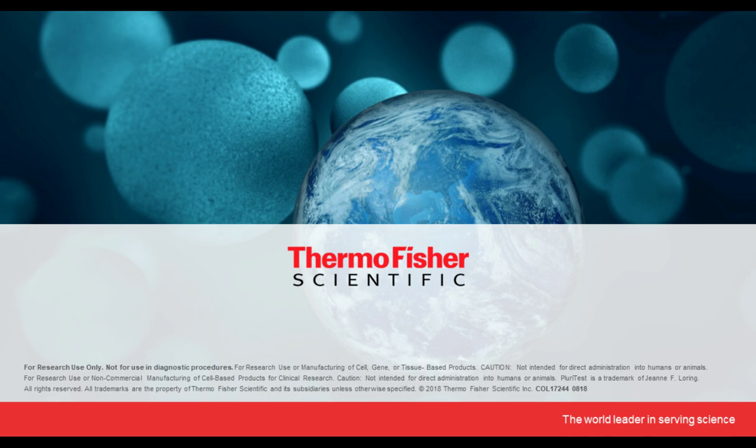Oh, I love that question. So I did talk about it a little bit in the talk, but I've had some researchers think that this replaces G-banding completely. And like we discussed, when it comes to a molecular-based assay, I can tell you if the gene is there or not there, or whatever it is that the probe is detecting, but I cannot tell you if it's moved. So translocation cannot be assessed.